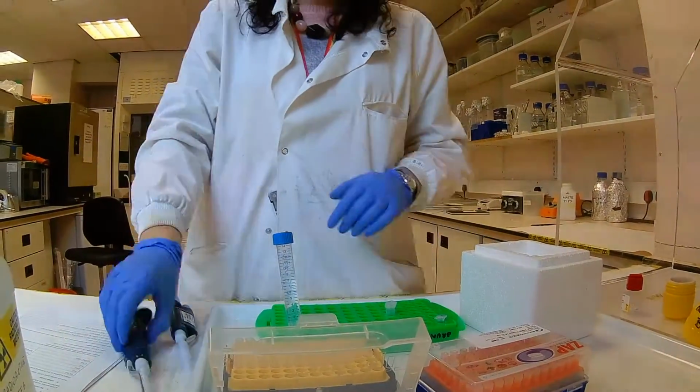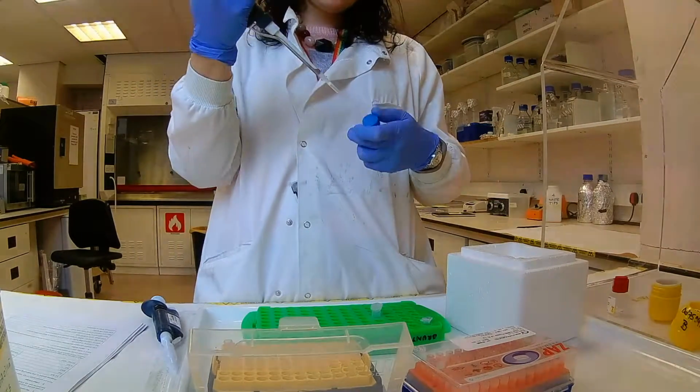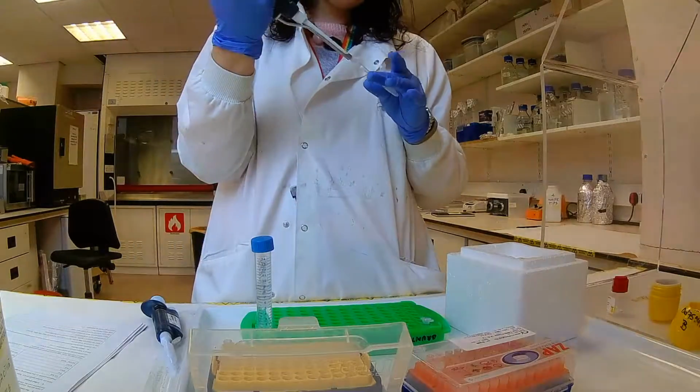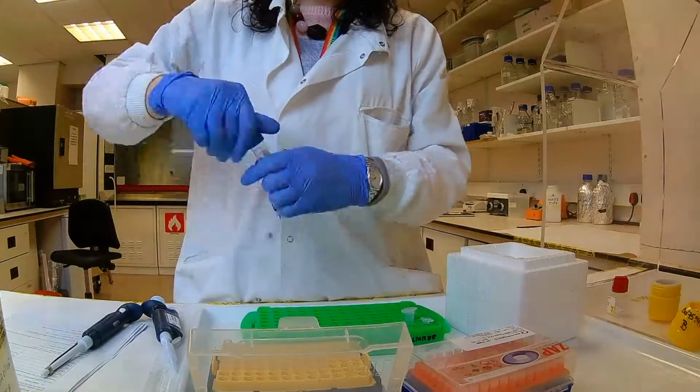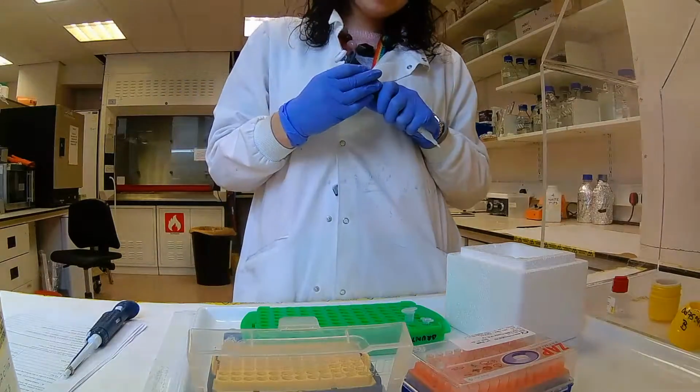Once it arrives, I need to add a radioactive label to this sequence. This will be important later so I can visualize where the probes have actually bound, so I can then see where and how much of my gene of interest is there.